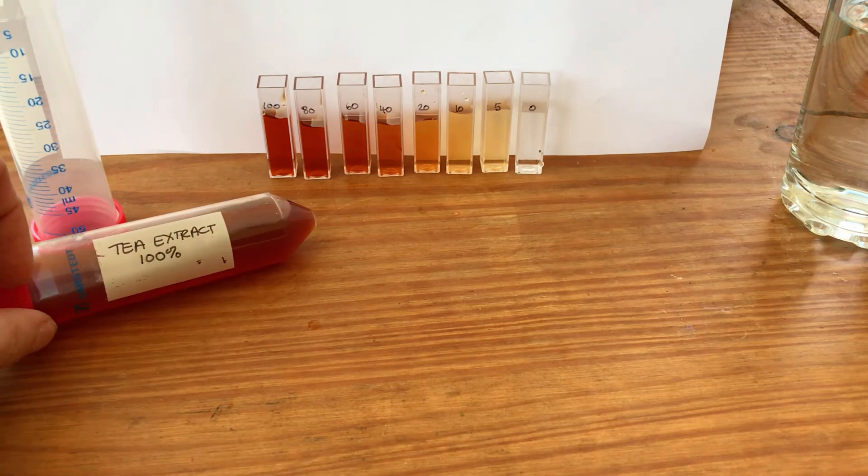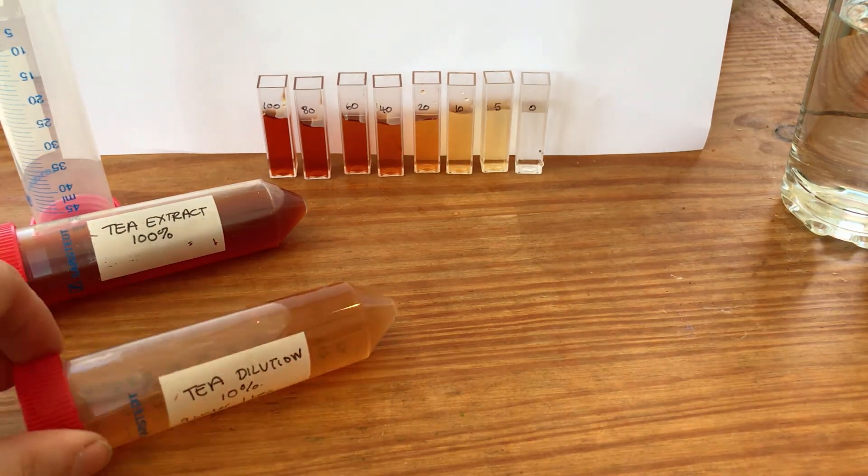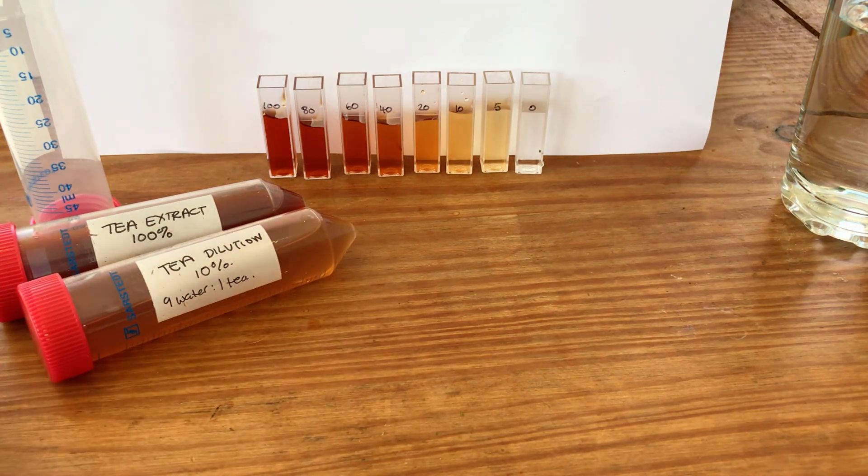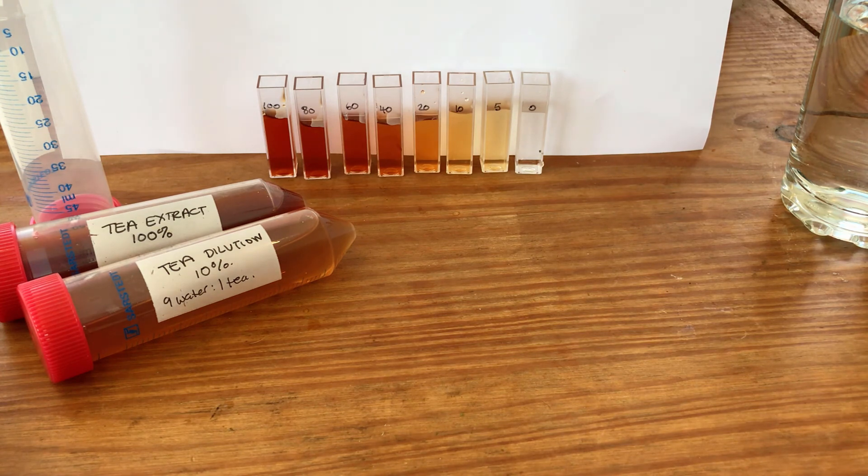For this experiment we're starting by making up our concentrated tea solution, that's literally just a cup of tea. We then made the 10% solution which was nine parts water to one part tea to get more dilute. We use the values in the table to set up our dilution series so each of these cuvettes has got a different concentration of tea in it, and then we quantify that using the mobile phone colorimeter setup.